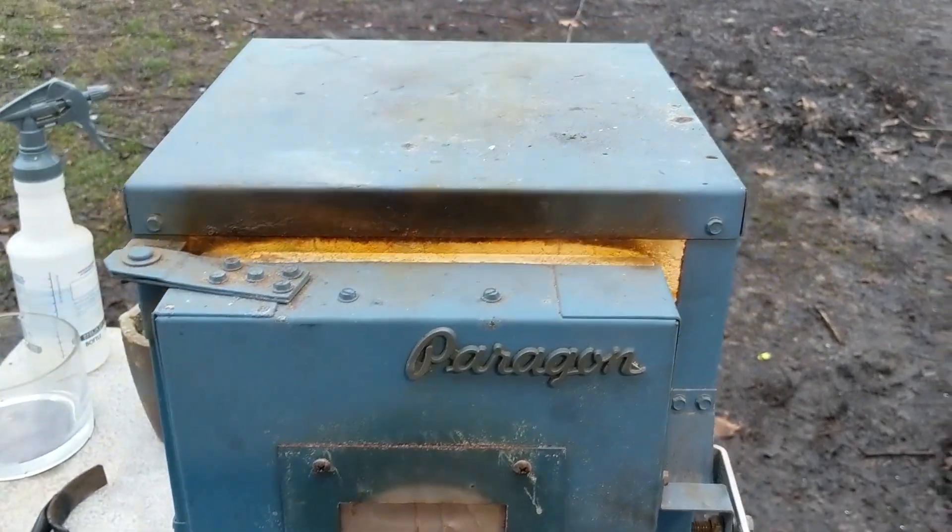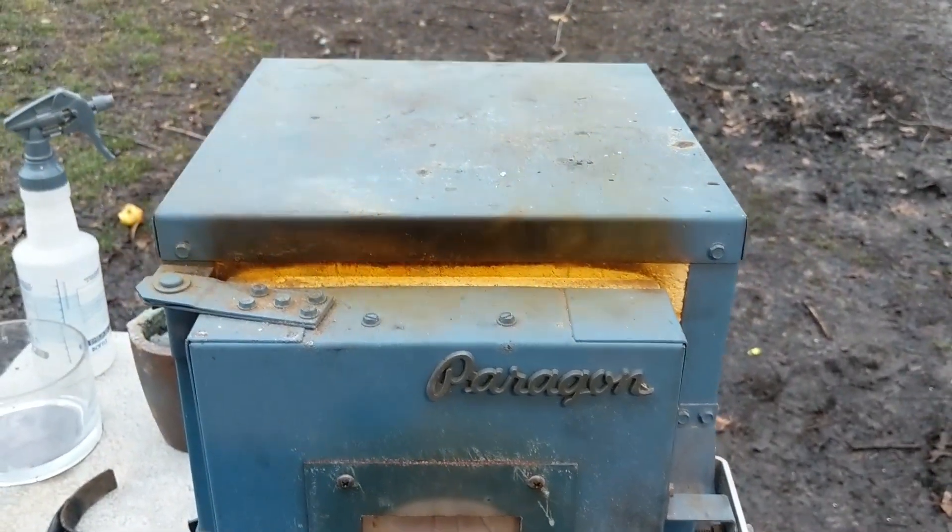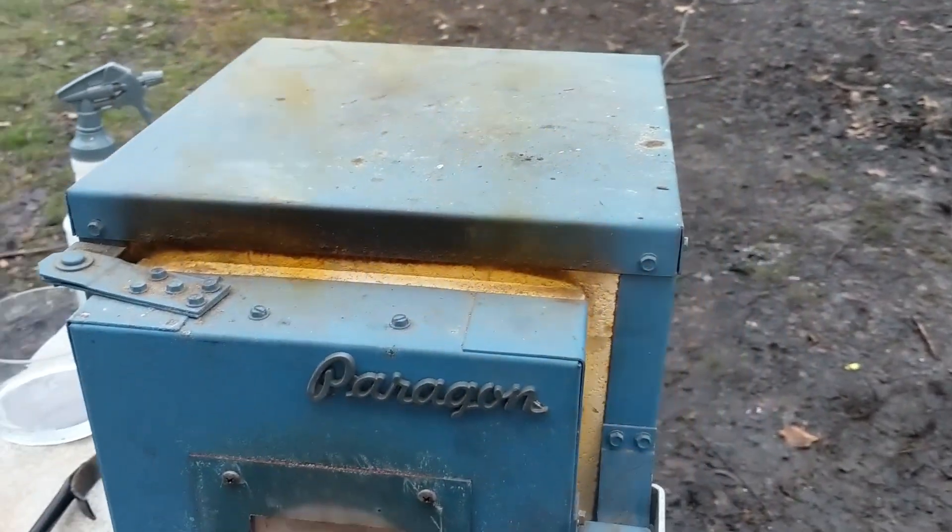This is the gas off put from whenever you decompose silver nitrate.